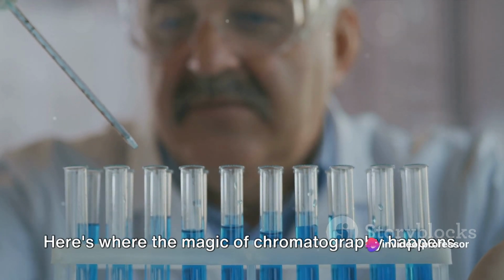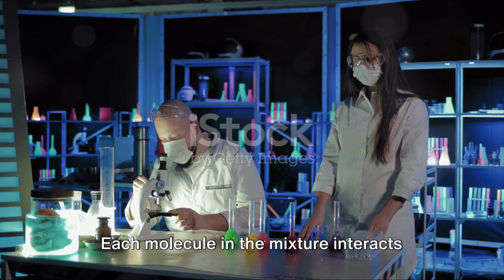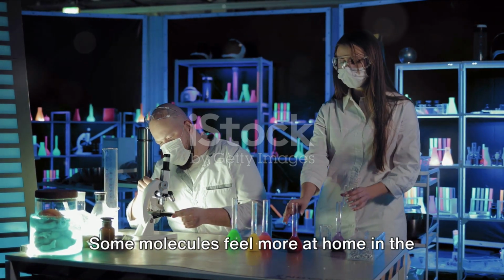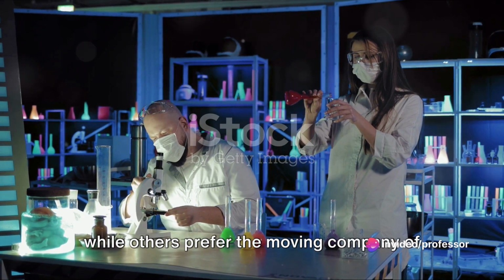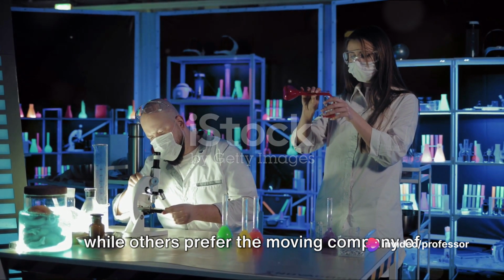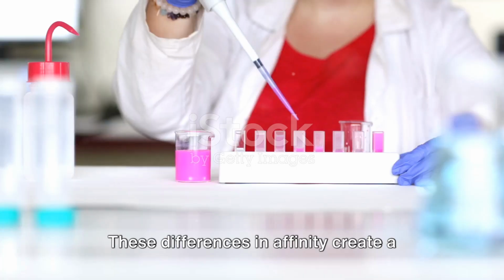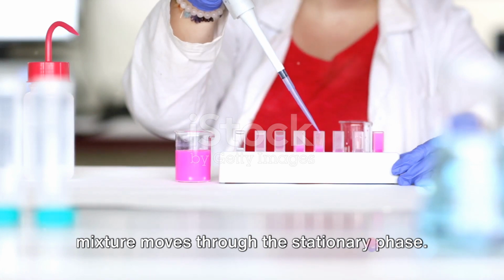Here's where the magic of chromatography happens. Each molecule in the mixture interacts differently with the stationary and mobile phases. Some molecules feel more at home in the stationary phase and tend to stick around, while others prefer the moving company of the mobile phase. These differences in affinity create a beautiful dance of separation as the mixture moves through the stationary phase.